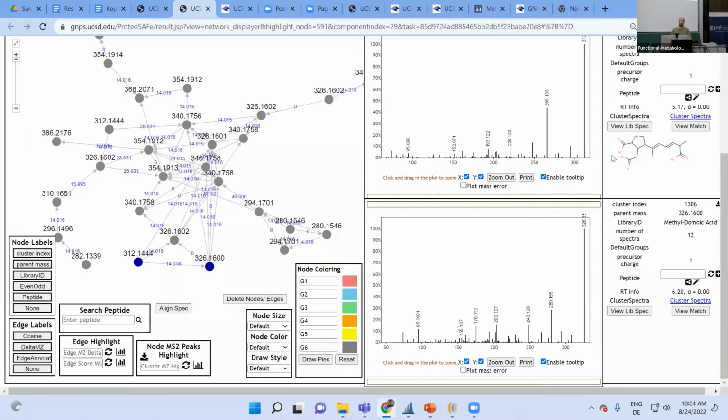And in our case, it was successful, and we could show by total synthesis downstream that this was actually correct. And I think this is really powerful, because I don't need to purify something right away to get an NMR structure, which, hands down, at the end might be one of the options I have to ultimately prove it, but I get suspect structures or putative structures fairly quickly. So yeah, I think that is very useful.